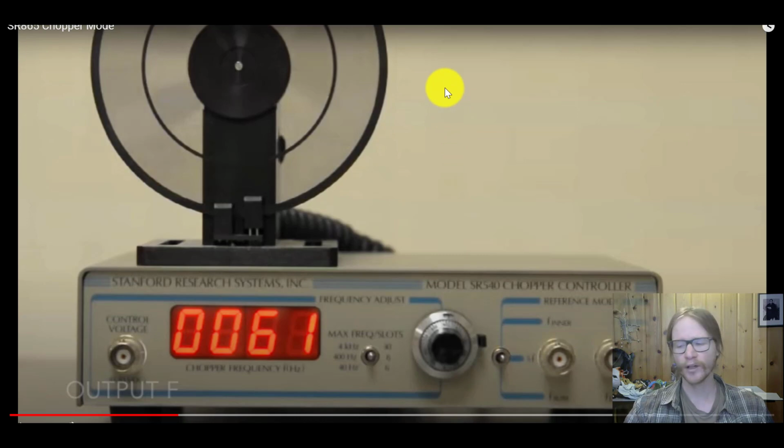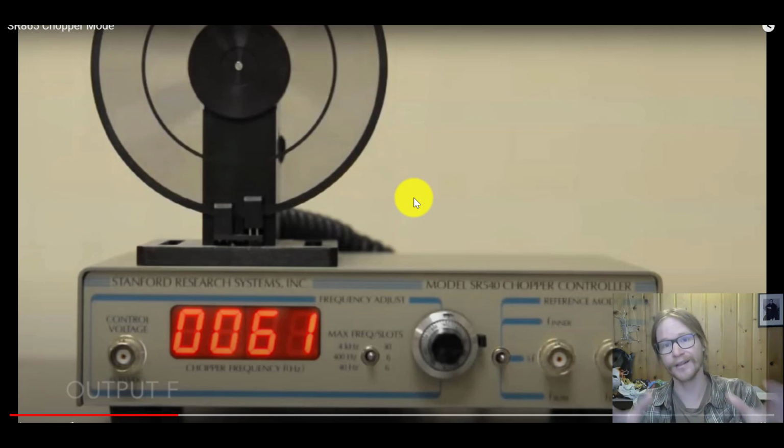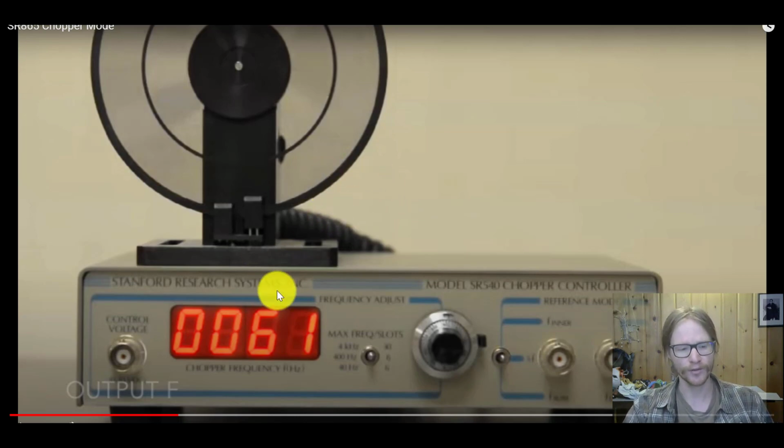So if you look at the dual beam UV vis setups that we have in the department, this whole unit plus the lock-in amplifier, they're all built into the UV vis. You don't see all these peripheral components. These would be components if you had a big optical table with a bunch of holes on it and you're mounting all the mirrors and lenses, your light source, etc., and you're building your own device. This is when you would use a setup like that.